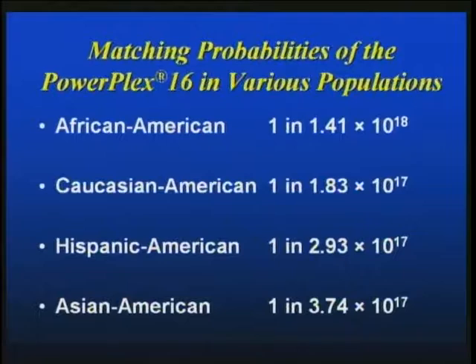There is no way. But this is very powerful for us, especially when you have multiple donors and recipients and you're trying to look for alleles that are informative. You need this breadth of power of discrimination. So this is what a typical profile would look like for an individual.